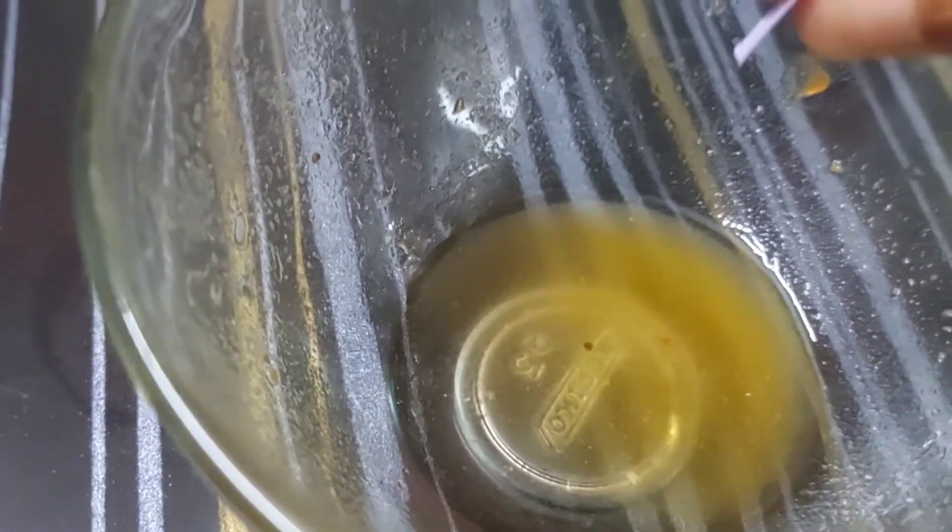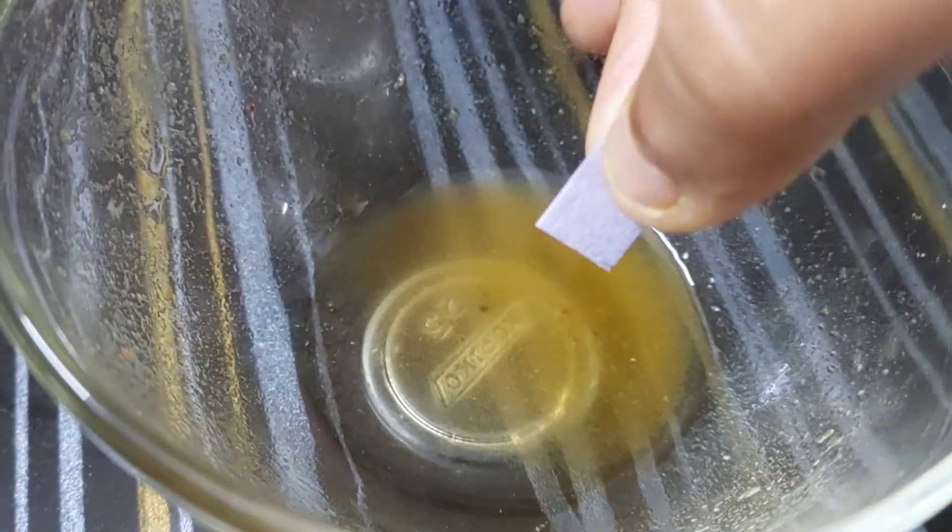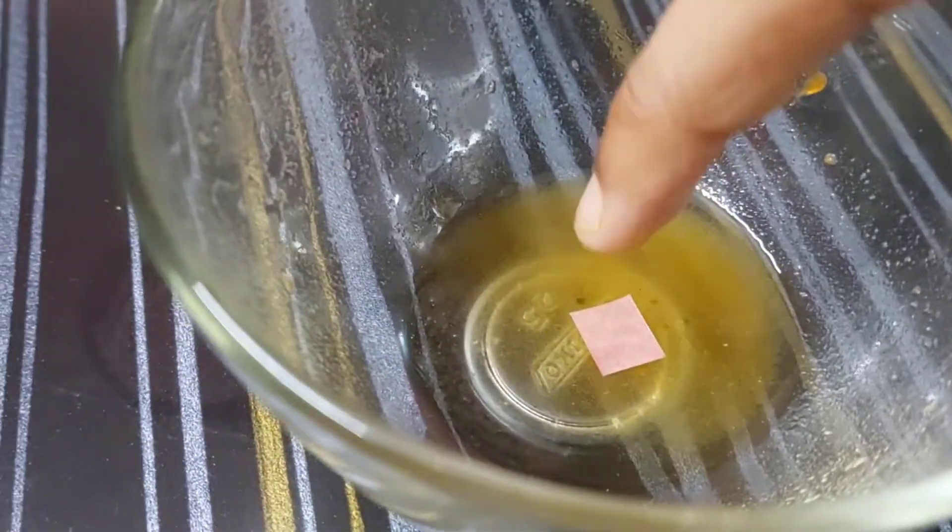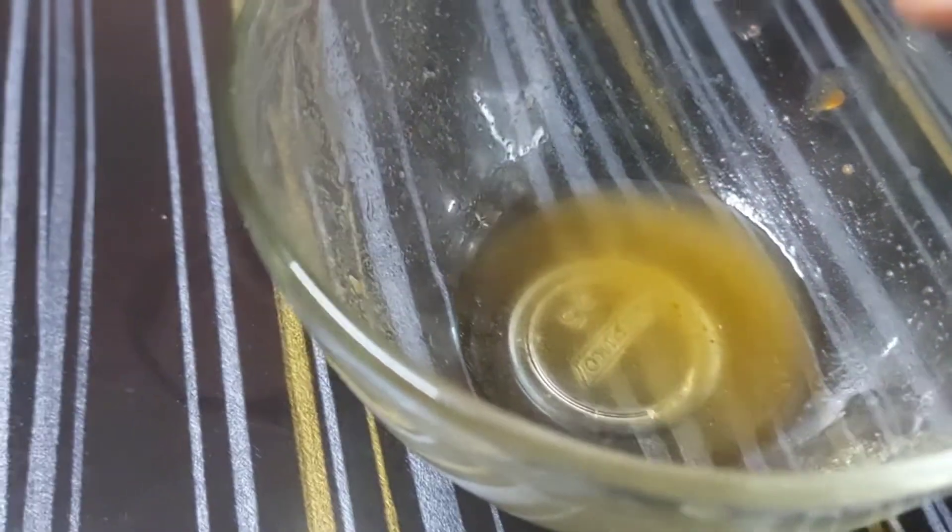Now we have tamarind water. We'll put blue litmus paper into this solution. Here you can see it is converted into red litmus paper, which means it is acidic in nature.